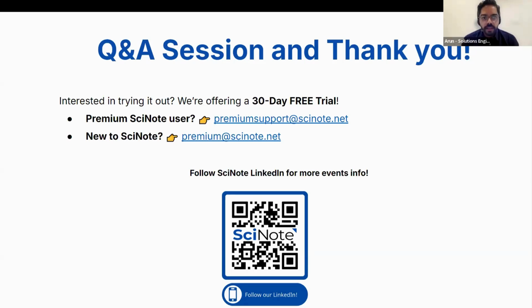Excellent. And then we actually have a two-part question next. Do we have a chain of custody on the samples? And is it possible to make aliquots, and does the system have a genealogy to trace the parent-child relationship? So the parent-child or item relationships is a slightly different feature. As much as we'd love to dive into this feature today, rather please feel free to reach out to your customer success manager or SciNote support, and we can schedule a meeting to go over the item relationship feature specifically. But on the first question, Alenka, do you have any thoughts? Do we have a chain of custody on the samples?